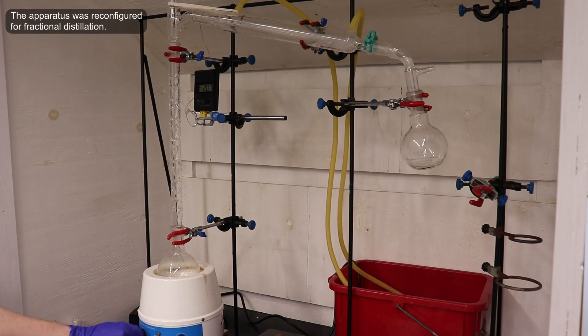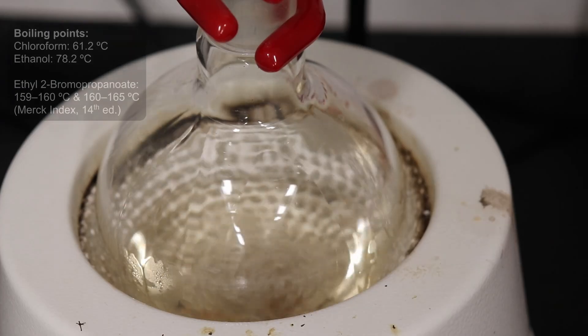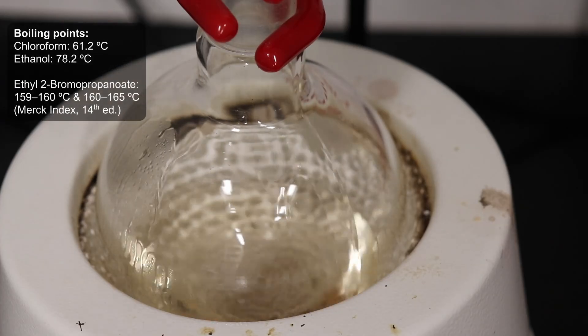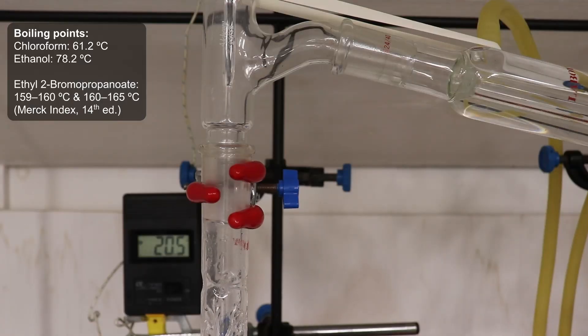Then the rest of the apparatus was disassembled, and replaced with a fractional distillation setup. On heating, the chloroform and ethanol begin to boil off first, and are collected in the receiving flask.